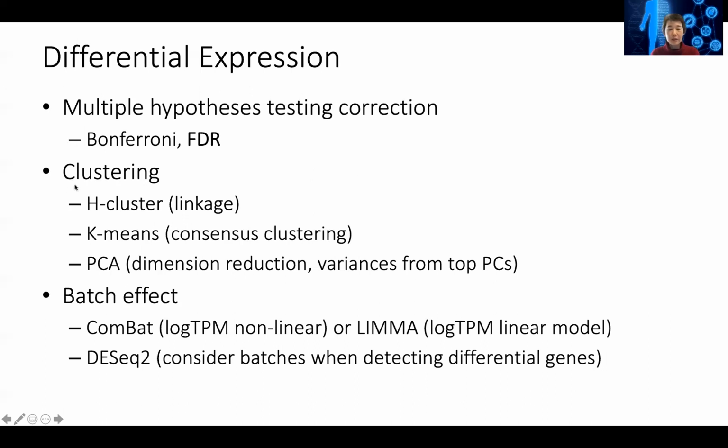Next, we discuss clustering. Because there are hundreds of genes that we're reporting as differential, to a biologist, it's very difficult to look at the gene names and understand what's going on. Therefore, we first try to cluster the differentially expressed genes based on their differential expression. And especially this is useful if you have multiple conditions. Let's say a time course drug treatment, you use the clustering of all the genes to look at the overall behavior of genes over the time course.